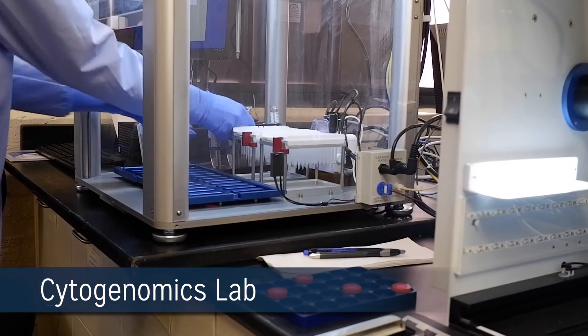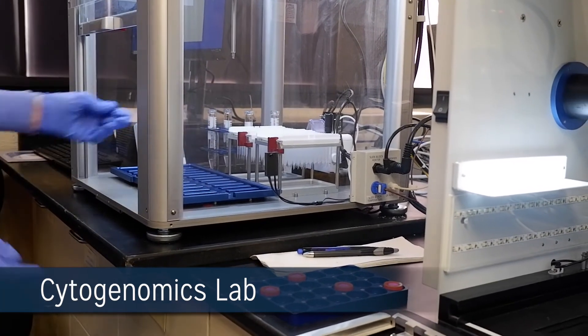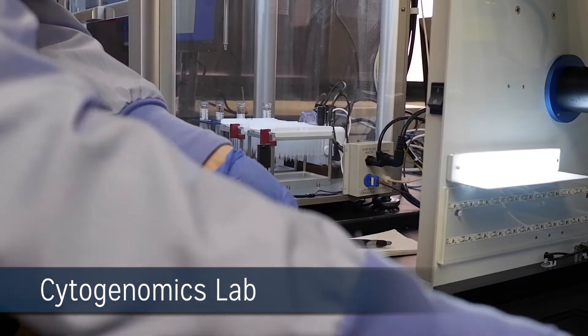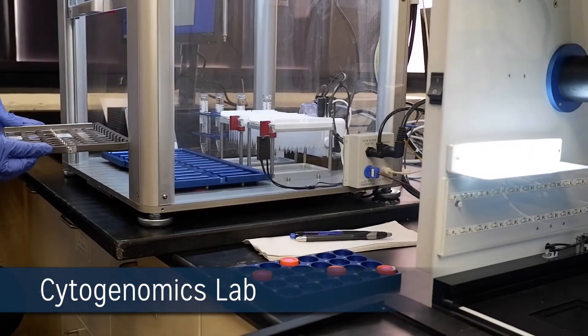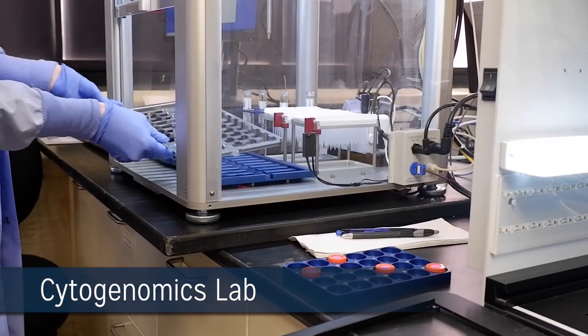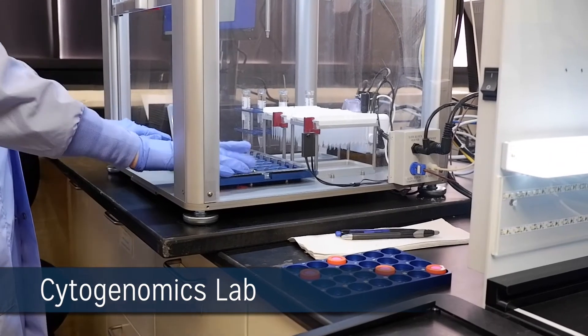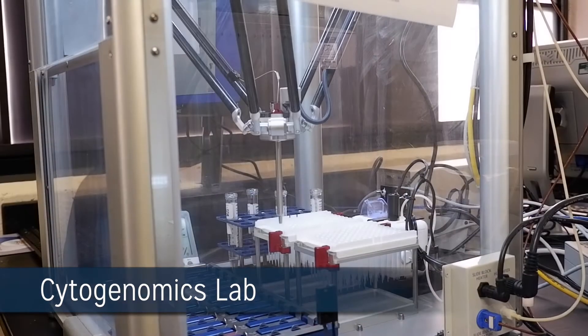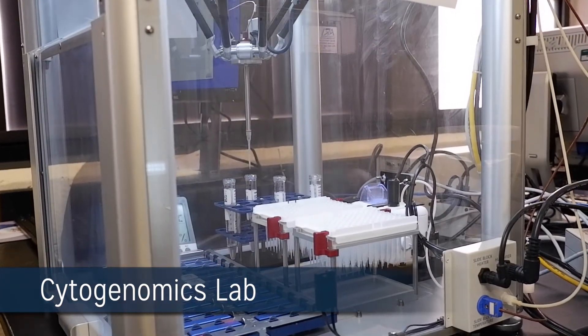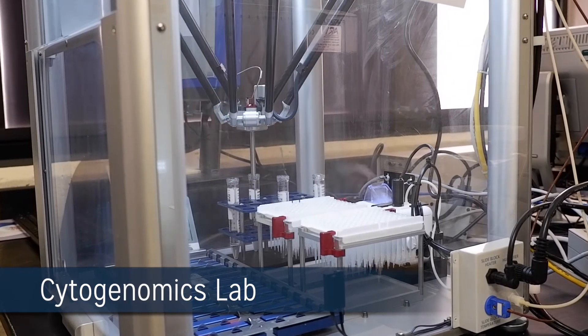The Scorpion robot creates an environment that is ideal for optimum metaphase spreading, reducing or eliminating the known inconsistencies of manual slide preparation. Up to 24 slides can be processed in less than 10 minutes. Environmental optimization provides technologists with high-quality metaphase spreads for analysis.